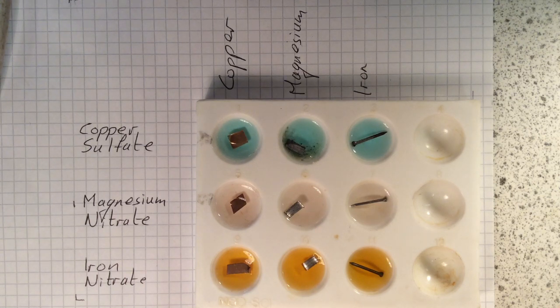And you're going to have to take my word for it. Maybe it will show up on the video a little bit clearer. But iron is also reacting with copper sulfate. So the iron is coming along and stealing its sulfate away. So that tells me that magnesium and iron are both more reactive than copper.